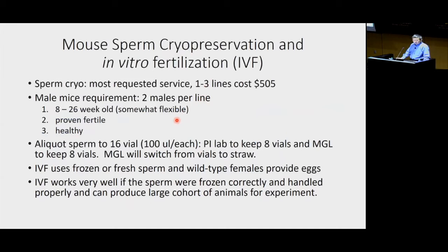And for the male mice, I have an age guideline in here, but the age limitation is actually flexible. But I require that your male is proven fertile. I received a few mice that are simply too young, the males. It's probably 8 weeks old, but never mated with a female.